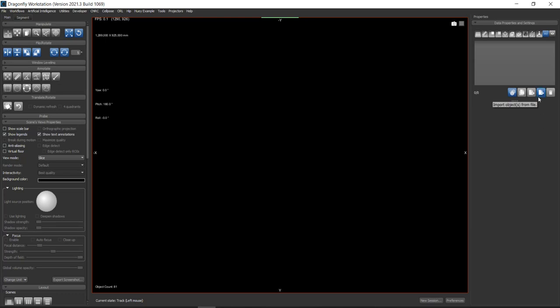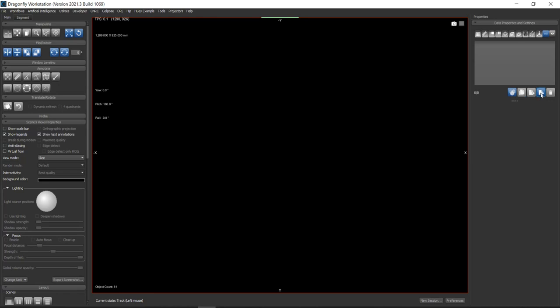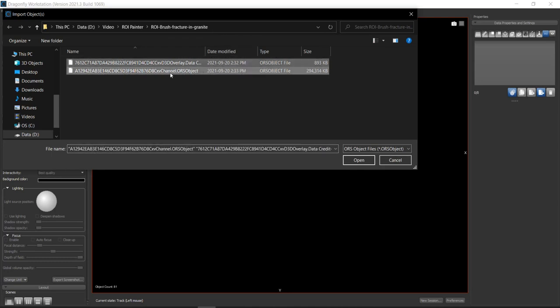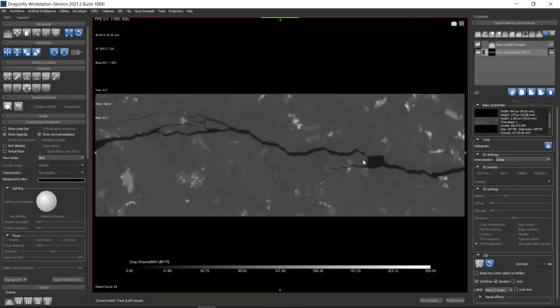First, let me load the data set. The data is in the form of ORS object file extension, so I'm going to use this option on the right: 'Import Objects from File.' Click on that, then navigate to the folder where your files are, select the files you want to open, and then click Open.